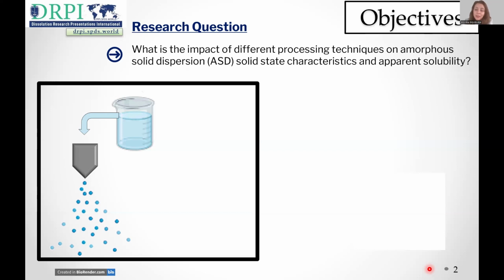To address the limitations of the spray drying process, co-precipitation has emerged as a prospective alternative due to possible enhanced downstream processing properties of the produced powders and more common access to the equipment used in the process. In the co-precipitation process, the supersaturation triggering precipitation is induced by interaction of two miscible solvents. In one of these, API and polymer are well soluble, and in the other, they should be both poorly soluble.